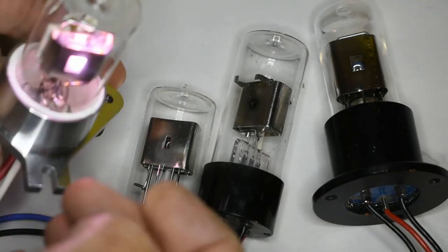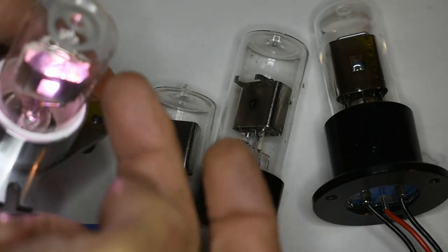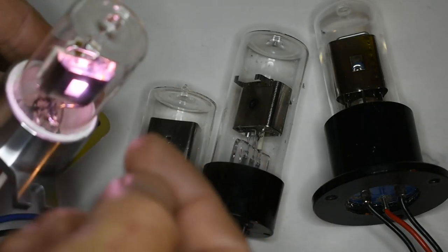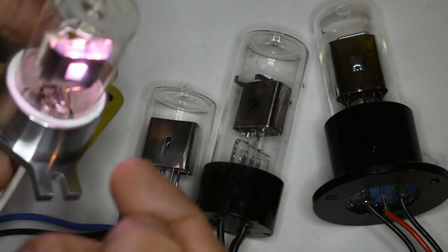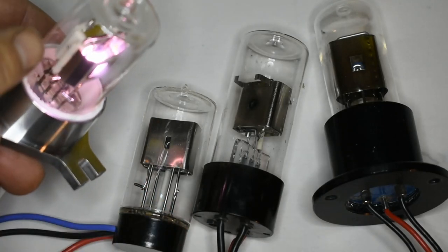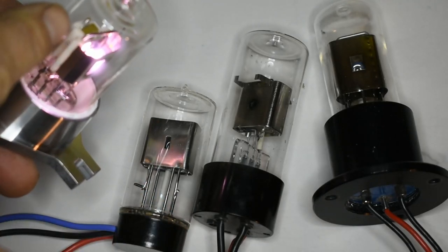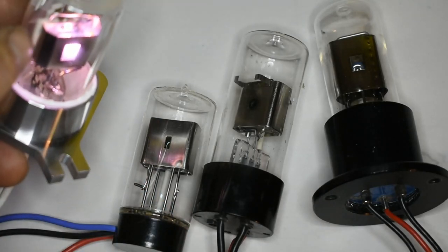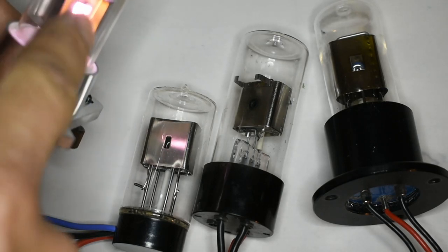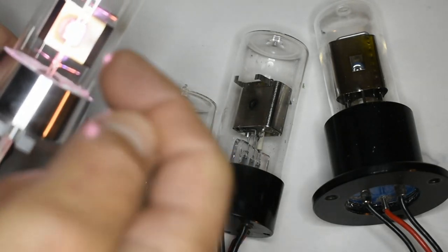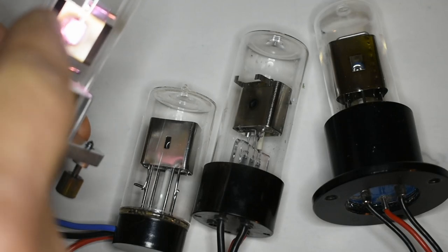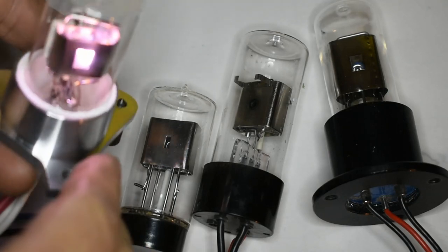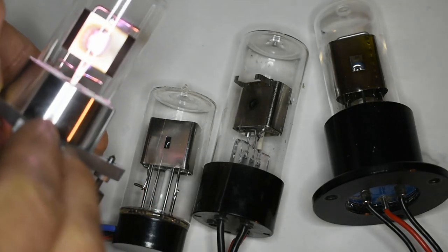The construction includes a heated cathode at this side in this particular one, and there's an anode in the back here with a window where the discharge can occur between the cathode and anode. You get an intense light source looking through the discharge in the anode.